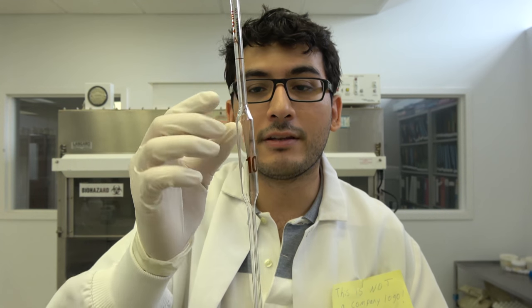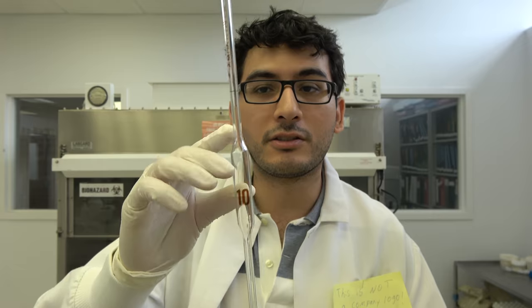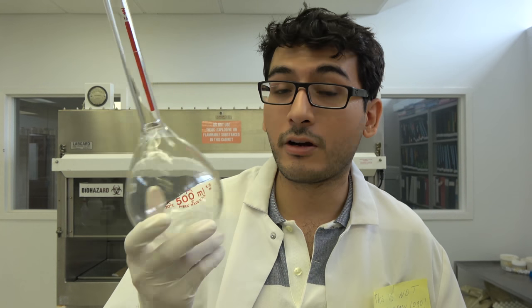A simple thing you can do if there's some liquid stuck in there is that you remove the plunger or the whatever and you just push it again with more air. It's simple. You don't need to put your mouth on it. I know how much you like to suck dick. Please keep that outside of the lab. These serological pipette tips, they're good for everyday usage but they're not insanely accurate. If you really want to be insanely accurate you want to use what's called a class A volumetric pipette. They have the amount written on this oval shape right in the center and they have this little line here that tells you that's the exact point where you should stop drawing up liquid.